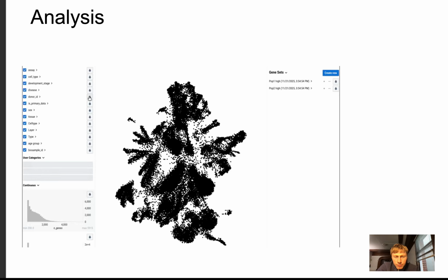It's not necessary, but it has nice functionalities. For example, you can figure out marker genes like this, if I remember correctly. Also, you can color it nicely, which lets you visualize it a little bit better. I have to be honest, I haven't figured out the full utility, how to maximize the use of this. But those are the basics for it.